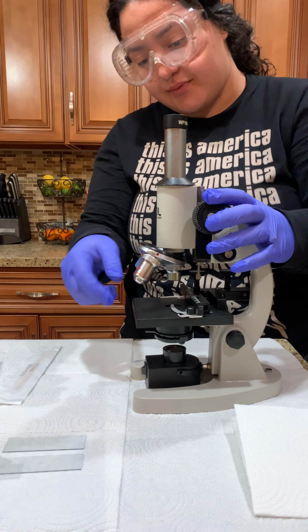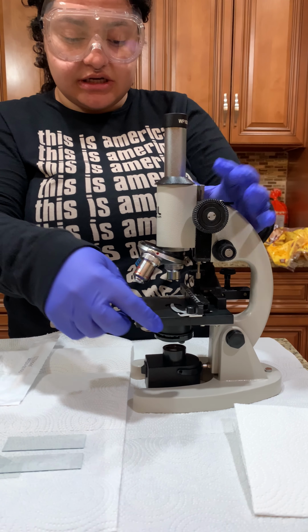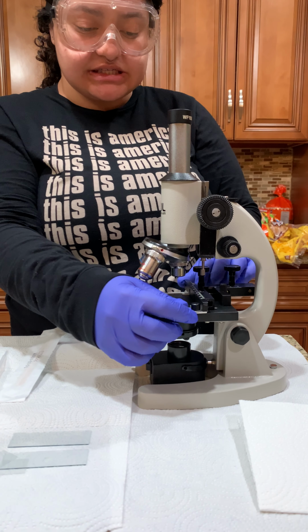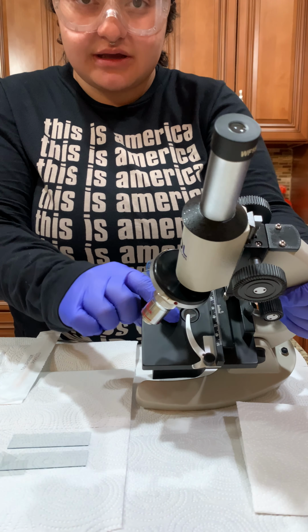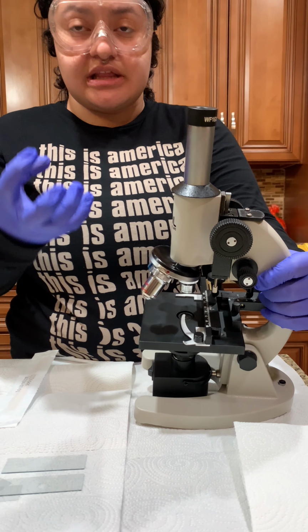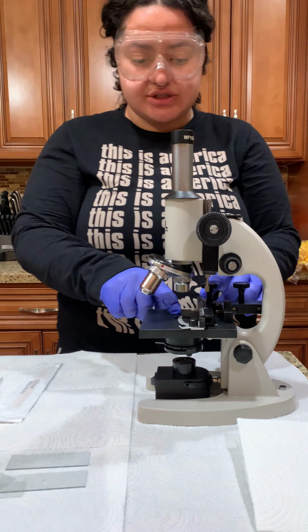And then right here, this black part is the stage. That's where we put our slides on. These 2 metal things are the slide clips, which will hold the slide into place. Right here in the middle, I'm not sure if you can really see it, that's a condenser lens. It's at the bottom of the slide to show the slide on top for us to fully see the cells in between it.